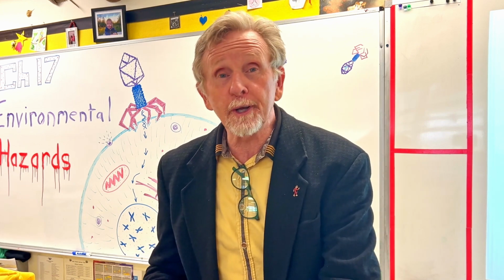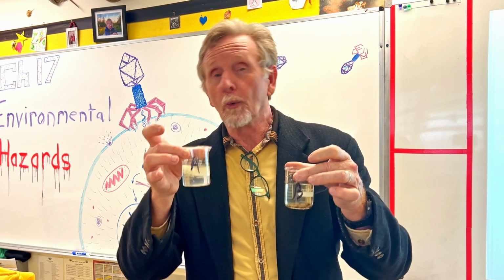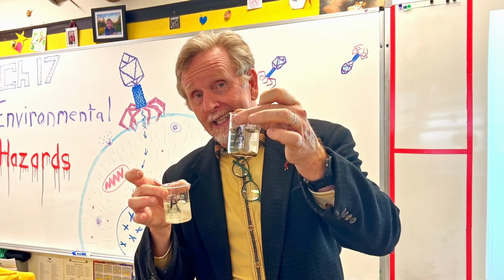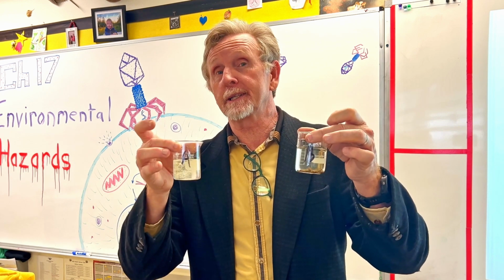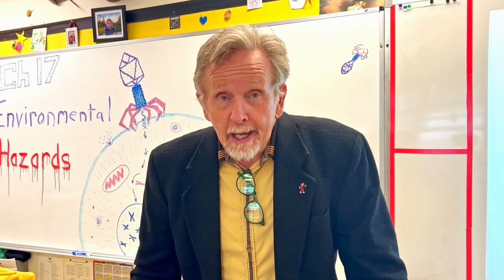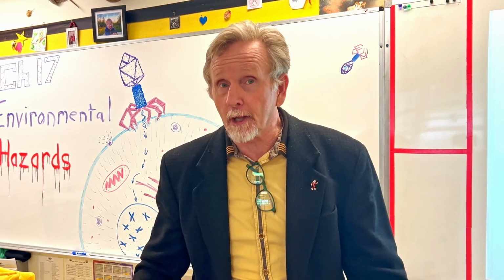Now we've got two different local water samples. These are both from right here at Viewholtz. One is from kind of our wetlands creek area, and another is from kind of a stagnant pond. So we're going to test these and see what we get. So come on in and we'll take a look at the actual data, see the test, and you can use that to fill out your forms.